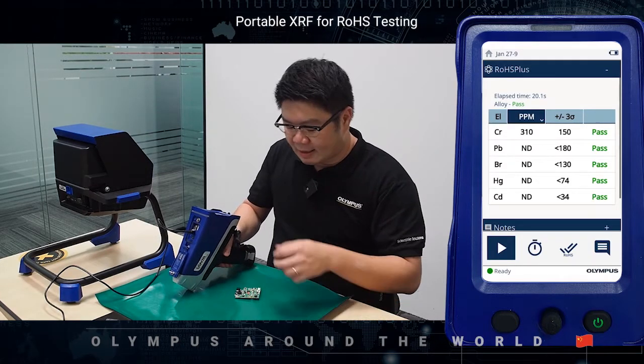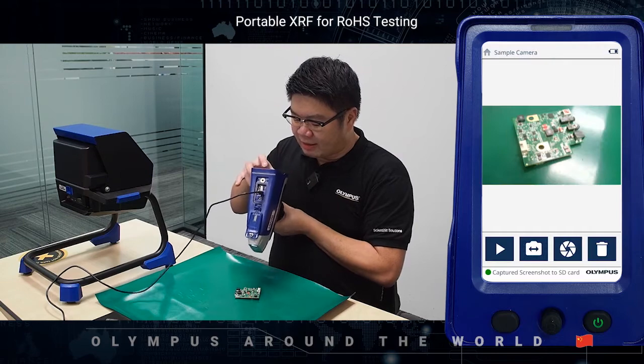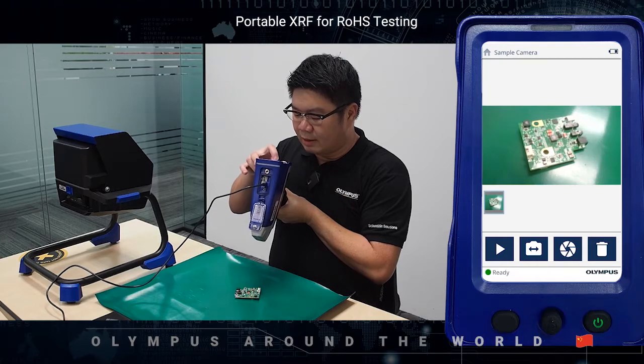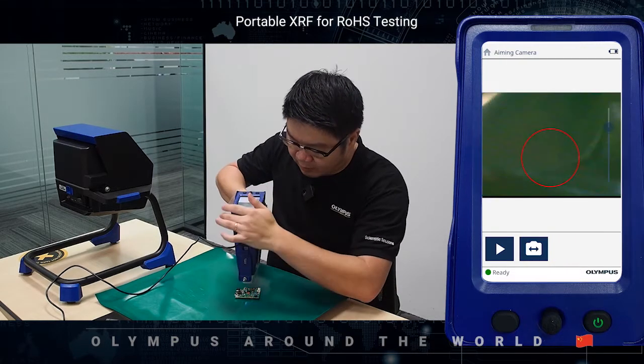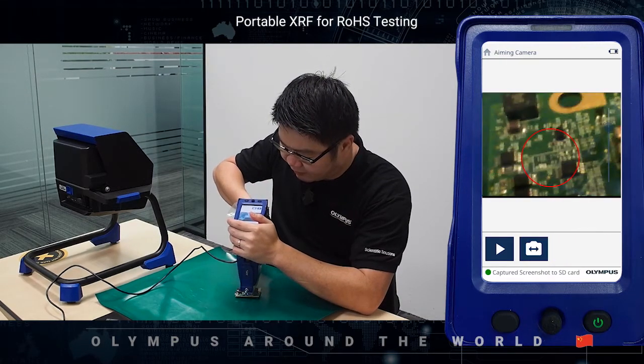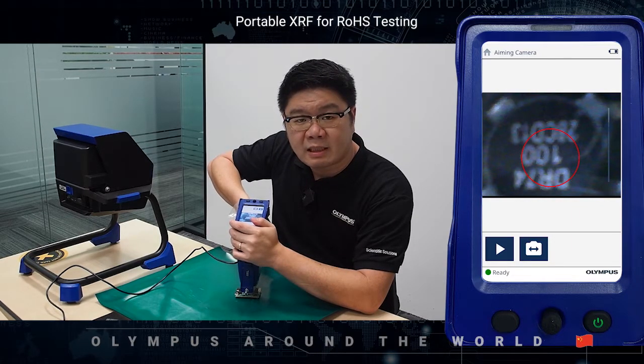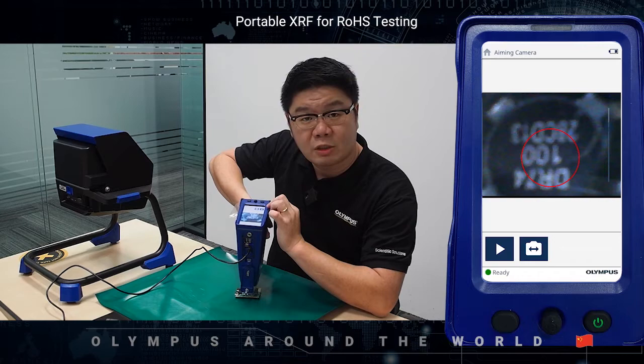Now to start the analysis, first you can use our external camera to take a photo of the entire sample, then switch to the aiming camera to target a specific spot on the sample, and to initiate a test simply tap the play button or squeeze the trigger.